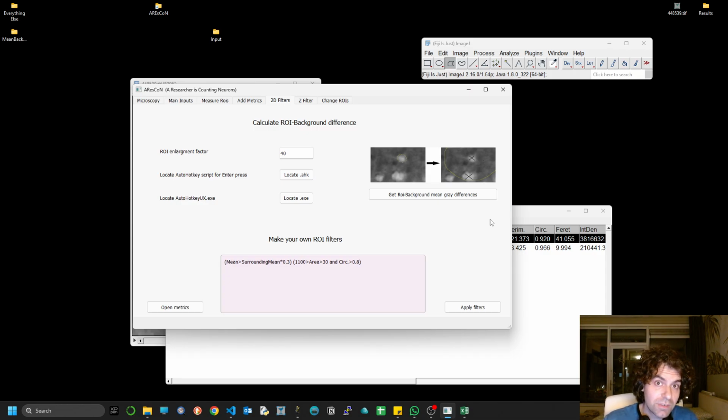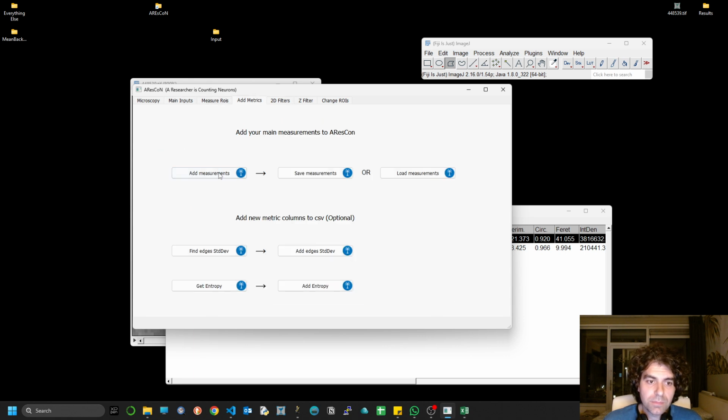You're making it more specific, so it's more likely that you filter something out, but you can do that, and you can put OR here as well. This is to make a set of conditions within one condition. But in my case, I will just leave the area, and I won't do any further. And I think the area for now is good for these purposes. And let's make sure that we add the new measurements, because now our main measurements have more information, right? So we want to add these measurements.